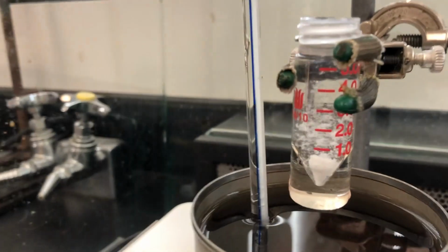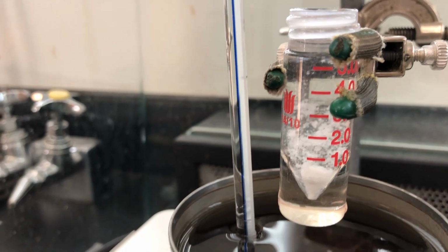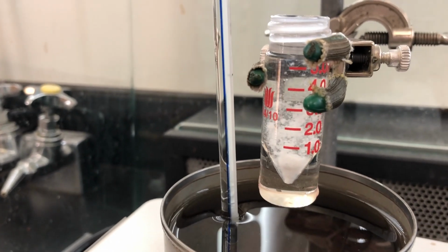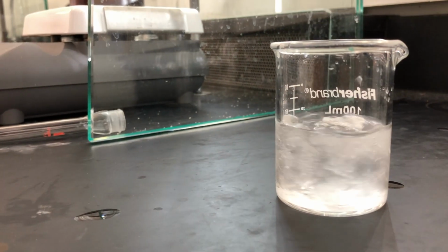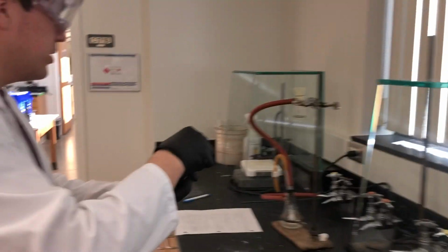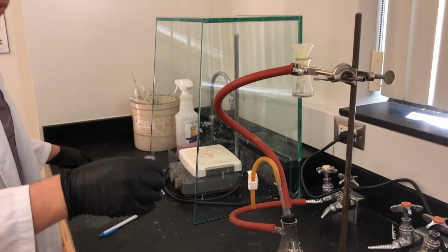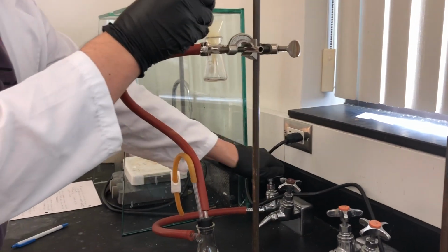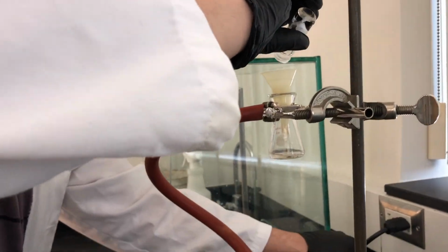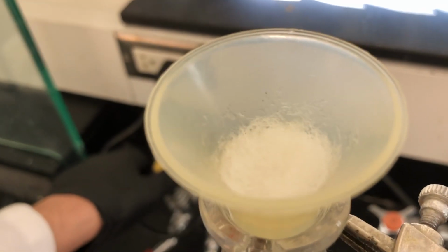And crude aspirin should precipitate. Oh, there, it's already precipitating because it's so cold. I put ice water in there. So I'm going to dip this in ice cold water just to get all of it to precipitate real well. And then I'm going to run it through the Hirsch funnel, and this will be my crude acetylsalicylic acid or crude aspirin. Okay, there. Yeah, we got some good aspirin. I'm going to clean this out and then we'll talk about recrystallization.